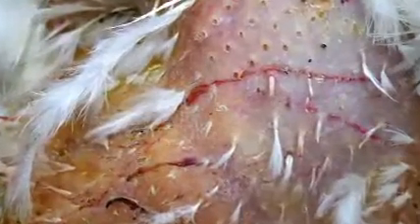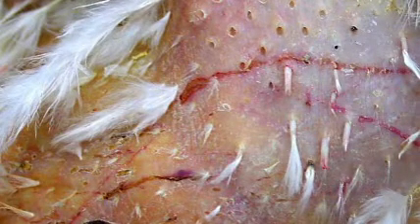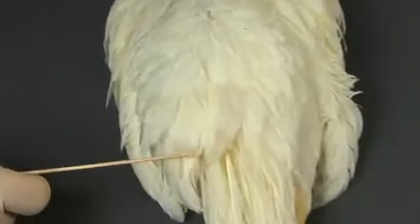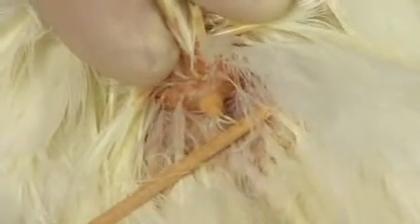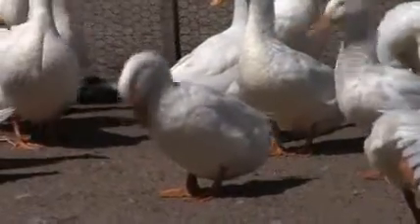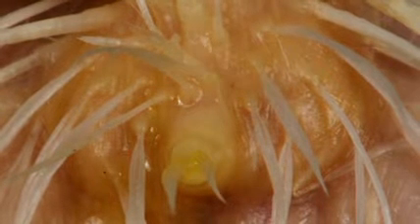In cases of pathologic feather loss, such as excessive feather picking by the bird or its cage mates, the skin will be traumatized. Place the bird in ventral recumbency and examine the uropygial or preen gland located dorsal to the base of the tail. This cutaneous gland secretes an oily substance that birds spread over their feathers during preening to maintain their feathers. The body of the gland is located subcutaneously, and its two lobes can sometimes be visualized beneath the skin. The gland's duct exits externally through a small papilla.